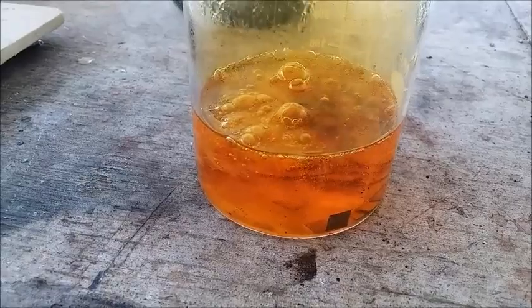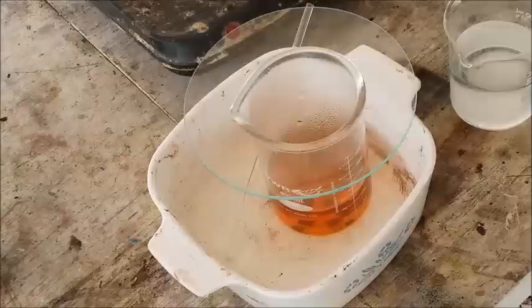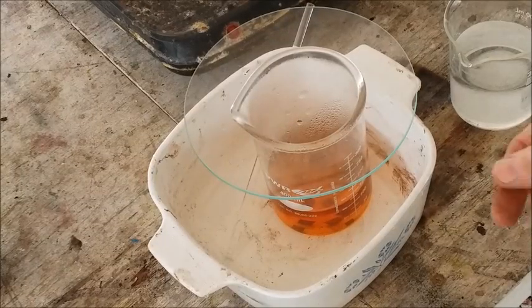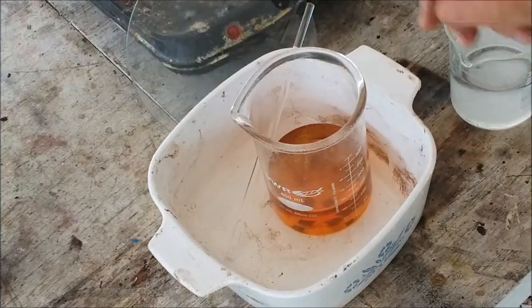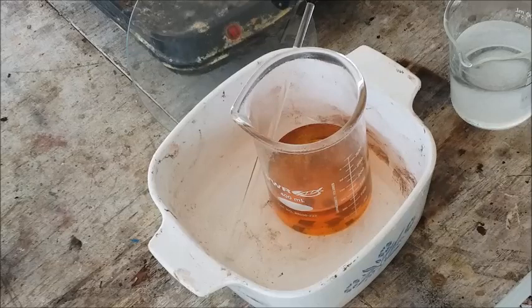And there's no more reaction. There should be no more gold in there. All right, the aqua regia's done its thing. The gold's all dissolved in there. No more reaction going on.